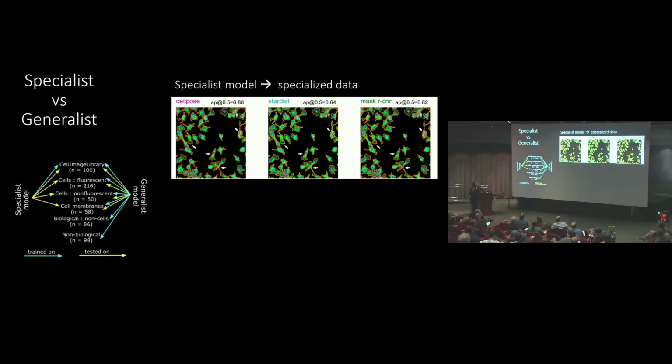And I'm going to come back to this. Stefan told us about a week ago in his talk that they've been improving on this algorithm with the authors of this algorithm, which he now calls Starfinity, but for now we only have comparisons with this one that's called StarDist. These are just different ways of solving the problem. So we're going to compare between frameworks, but we're particularly interested in comparing specialists and generalists.